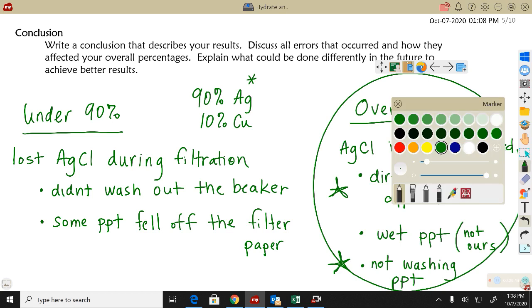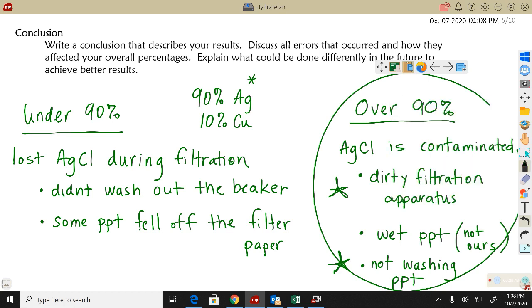When we had that flask, ooh, that's not a bad flask. I collected, like here's the filtration apparatus on top, and that's where I collected my precipitate. And then drip, drip, drip. This liquid dripped down into the flask, which we eventually threw in the garbage. But that's not all water. That liquid that was dripping through was a combination of a whole bunch of things.